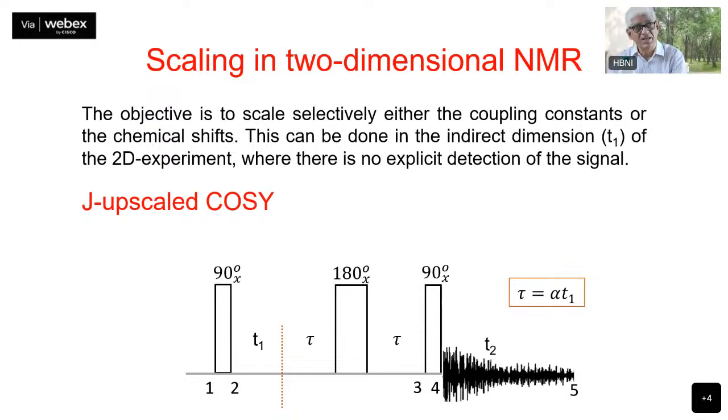The diagonal peaks had the dispersive character and in-phase character. The cross peaks had antiphase character and absorptive line shape, but they have positive and negative signals, as I would like to say here once more. Draw the cross peak pattern here for a two-spin system. Because of this positive-negative character, we had cancellations of intensities, so that will result in reduction of the intensity of the cross peaks.